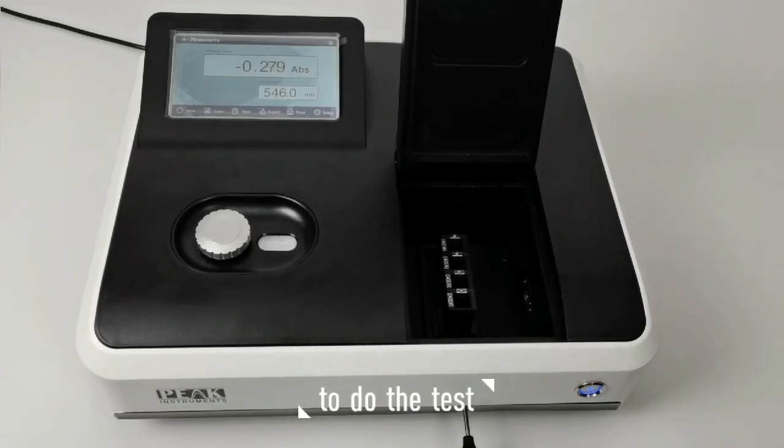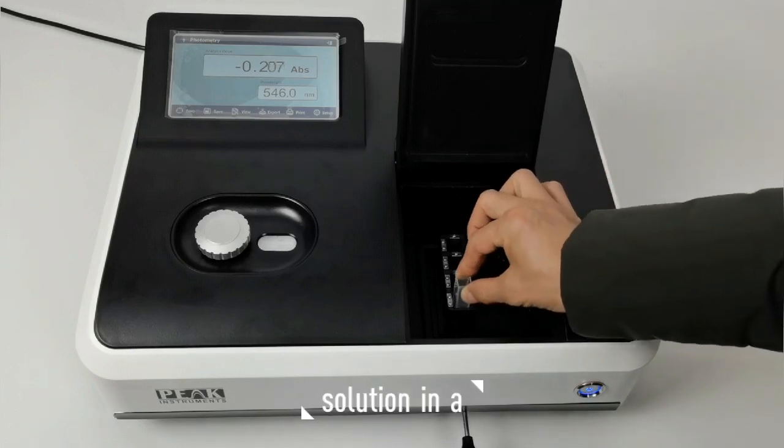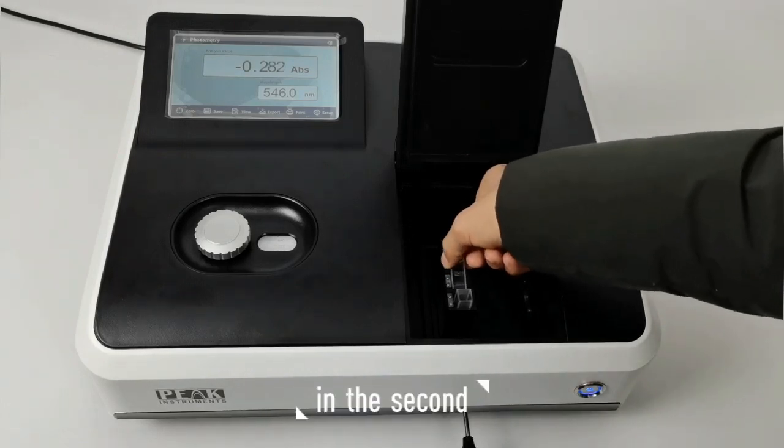Hello, this video will show you how to do the test. First, put the reference solution in a cell holder, and then put your sample solution in a second one.